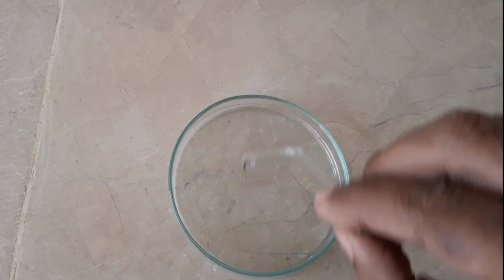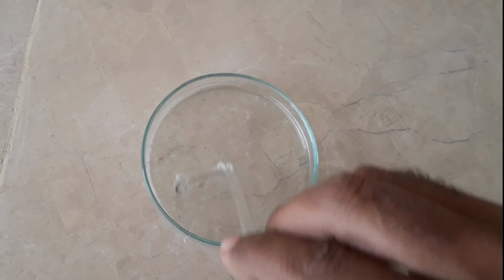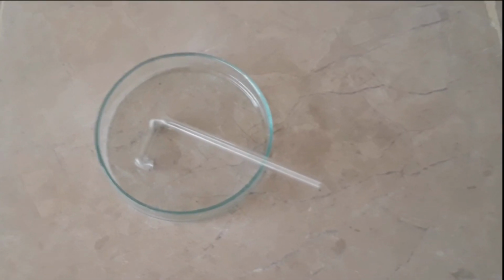Today, we're about to embark on a fascinating DIY project. We're going to craft a custom L-shaped cell spreader right here in your lab, using just a glass rod and a trusty lab lamp. It's a simple yet effective technique that's sure to elevate your cell culture experiments. So, let's dive in. Materials.